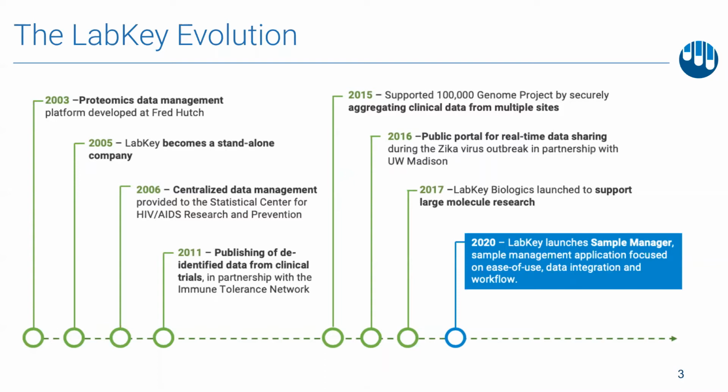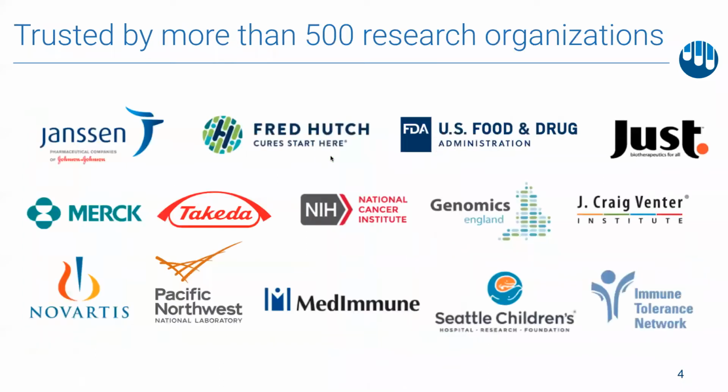We then launched our large molecule biologics development product with Just Biotherapeutics. About 2 years ago, we started to investigate options for developing a new product that would serve both current and prospective clients, LabKey Sample Manager. As you've heard and can see here, we partner with a large variety of groups across scientific disciplines, conveying the flexibility of our platform.